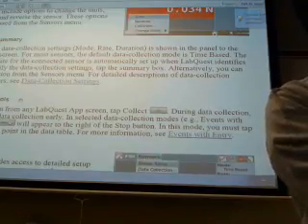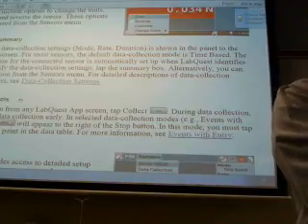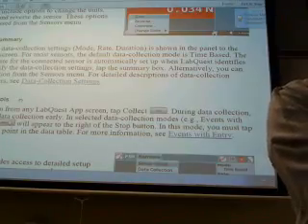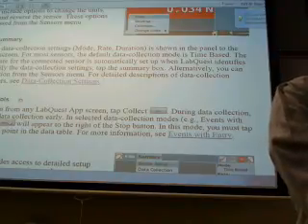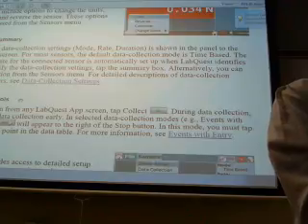New, open, save, delete, email, export, print, settings, quit. So it's basically what you see on a computer. If you hit Sensors, what do you see? You see data collection, right? So let's cancel out of that.